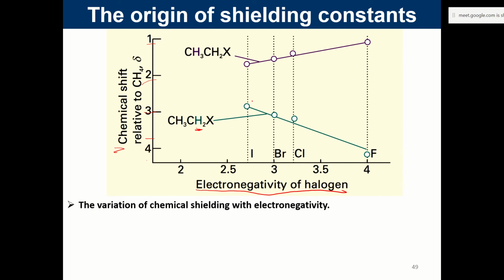It is consistently increasing. You can see the chemical shift value is increasing for this particular methylene proton.